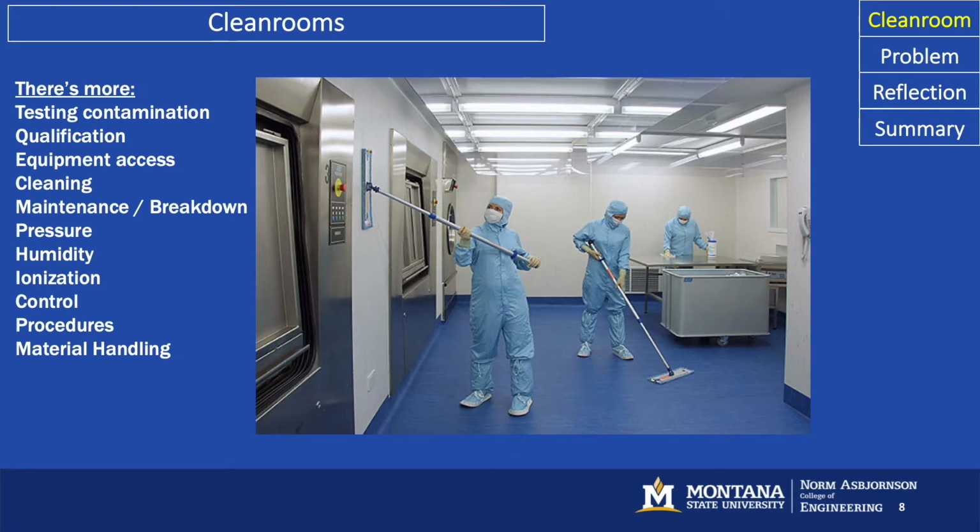We have to worry about testing, make sure that there isn't any contamination. What you see here are people cleaning with some really crazy chemicals. We need to worry about the humidity, even the ionization of the air.